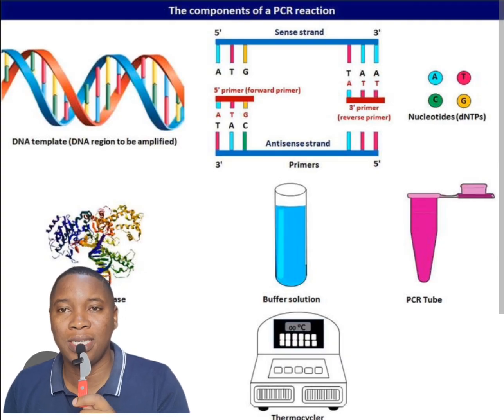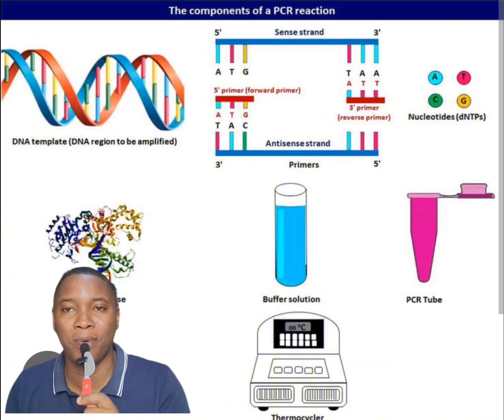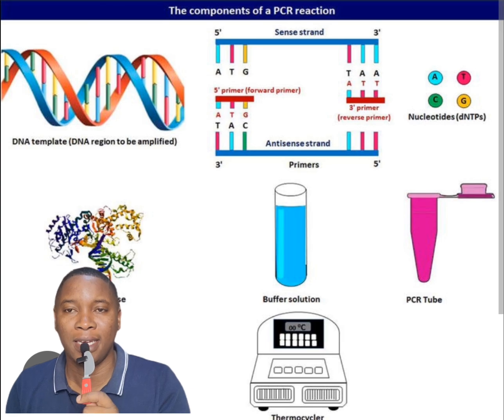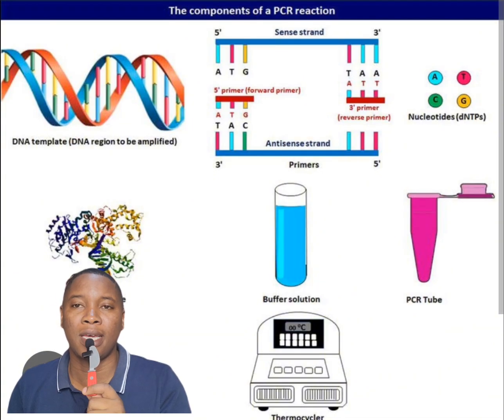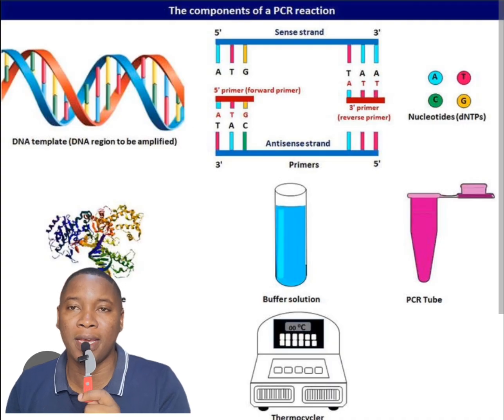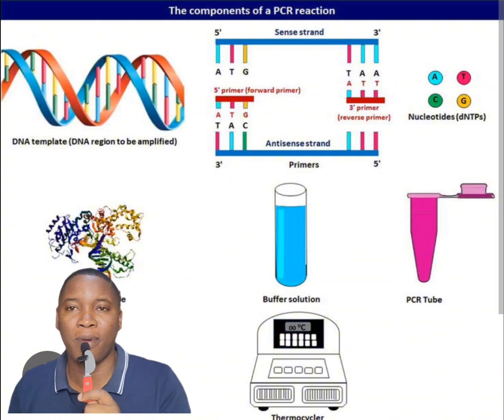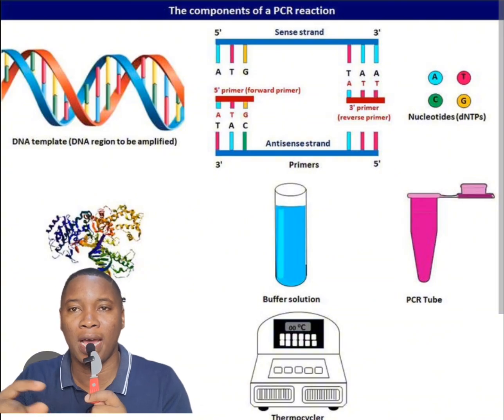Now, when you denature the DNA, meaning that you separate the double-stranded structure into a single-stranded structure, then the next process is what we call annealing. In PCR, we have what we refer to as primers, and primers are short nucleotide sequences which can mimic our target area. So you have a sequence that you're interested in, and you have primers that are similar but shorter sequences.